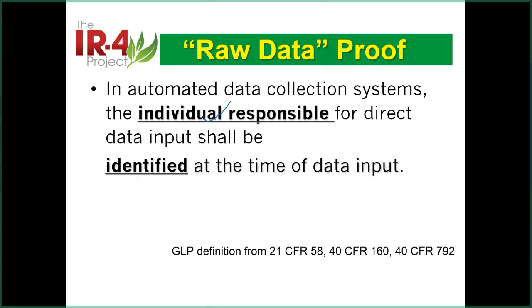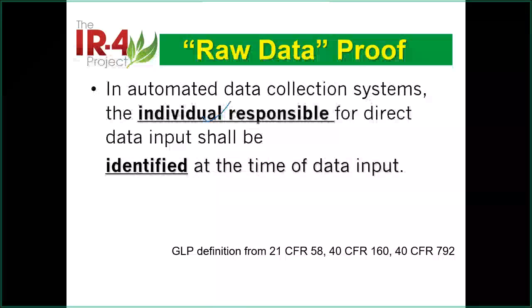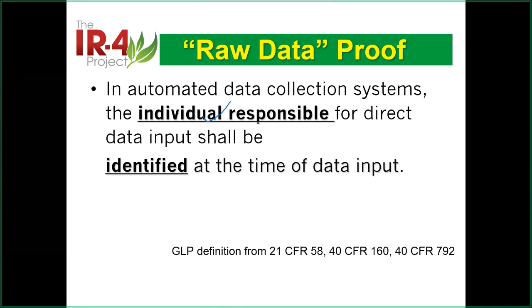If you are a user, you can only enter something. If there's a need to change, you need a higher level, maybe called the administrator level, to make some changes. So basically your direct boss can make certain corrections there.